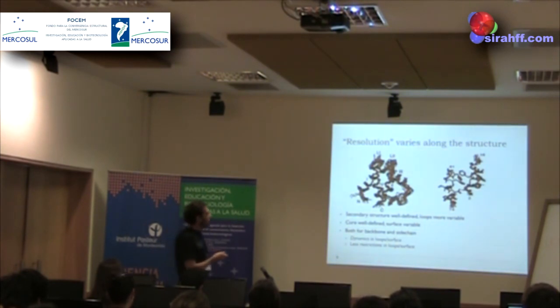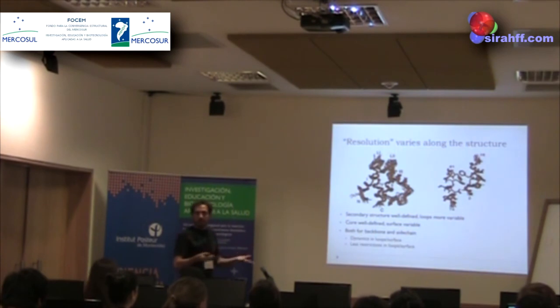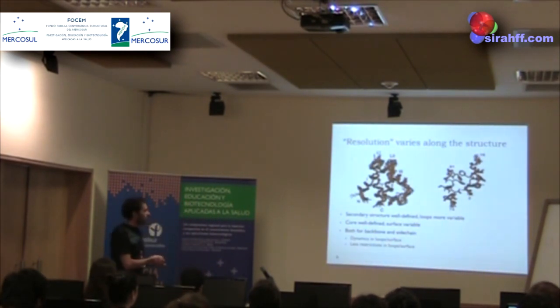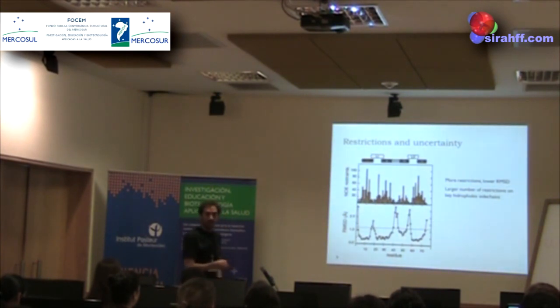The resolution, if you wish, there's no definition of resolution, but you can see in the bundles that it varies along the structure. In secondary structure regions, it's well defined, but loops are more variable. And the core is usually better defined because you have more restrictions and less dynamics in core regions than in surface regions. And you can see here, there's an inverse correlation between the RMSD of the bundle and the number of restrictions you have per residue. This is the number of restrictions you have, and this is RMSD. Low restrictions, high RMSD; high restrictions, low RMSD.